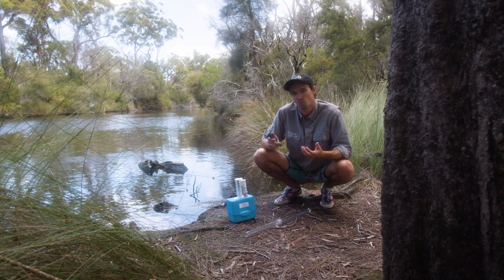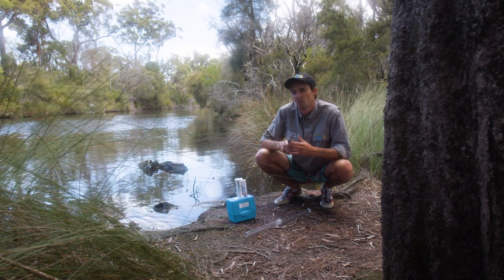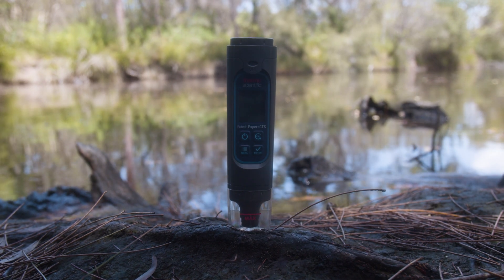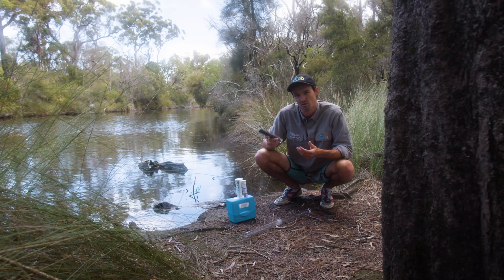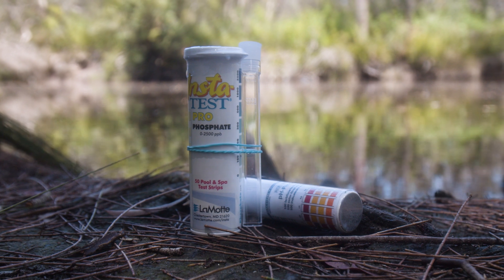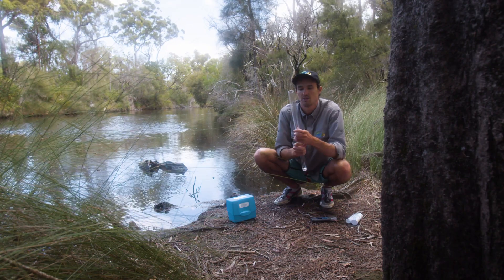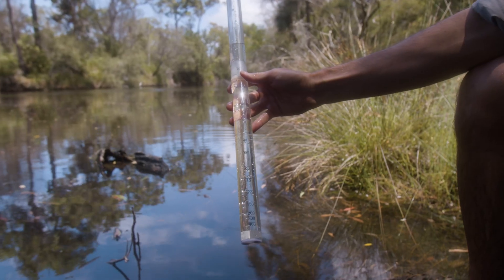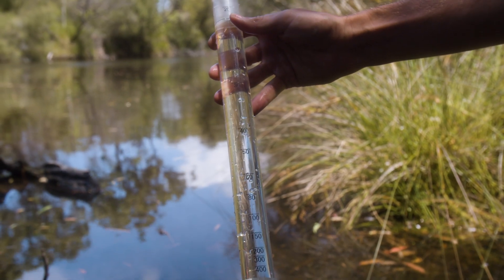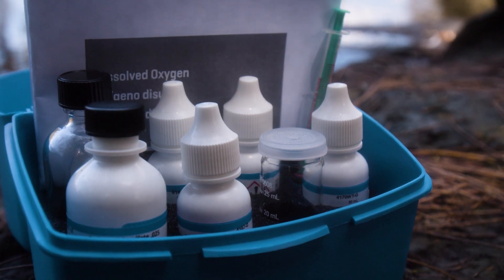Today I'm going to take you through how to perform six different water quality measurements which will indicate various physical and chemical parameters of the water we're sampling. First I'll show you how to use a digital probe to find out electrical conductivity and temperature. Next we'll use simple test strips to find out the phosphate concentration and pH. Then we'll use turbidity tubes to find out the clarity of the water and sediment load. And lastly we'll show you how to use dissolved oxygen titration kits, leaving the trickiest ones for last.